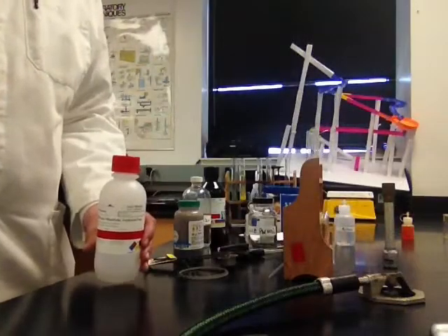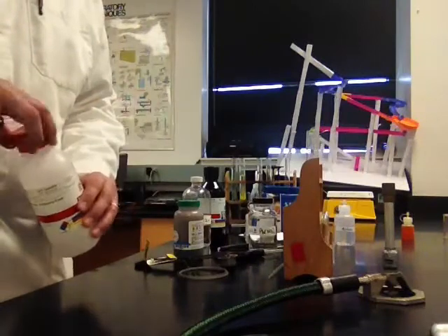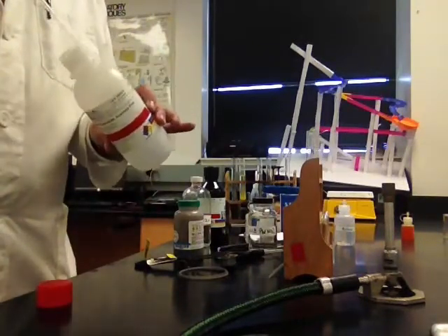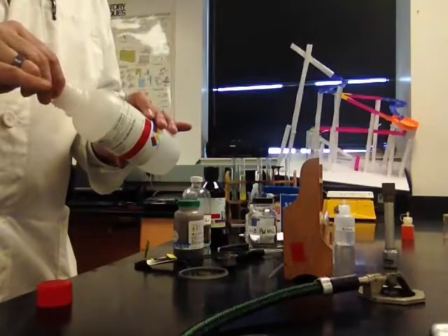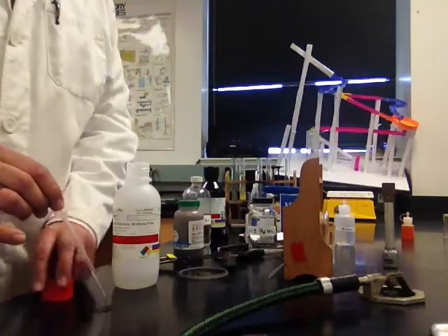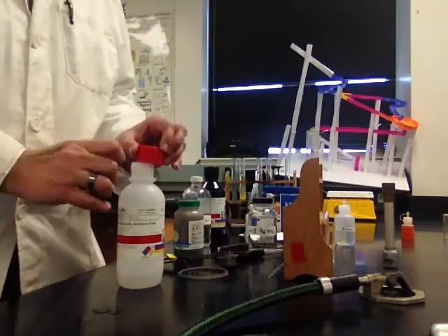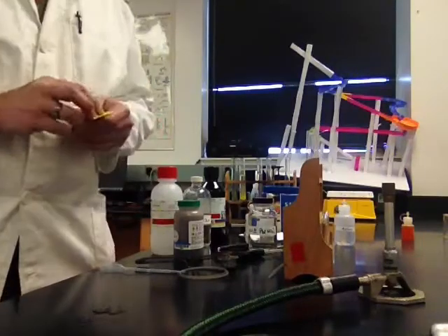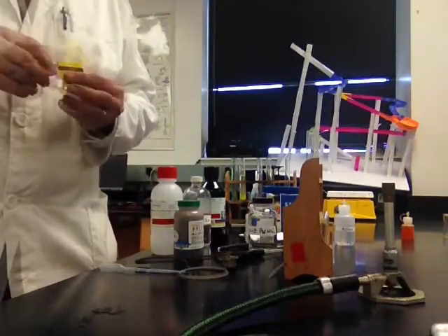So the first one of these I'm going to show you is a liquid. It's not aqueous. It's a liquid called methanol. Okay? Methanol is an alcohol, but it's not the kind of alcohol that you're going to want to drink at all. Okay? Methanol can actually cause blindness and death if you drink it. And I'm just going to light it on fire, which is always fun.